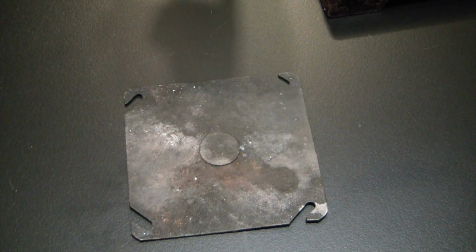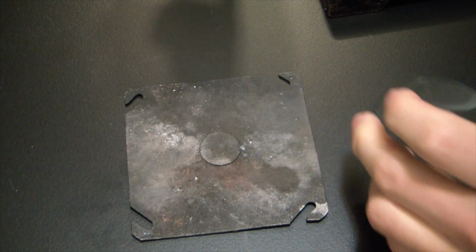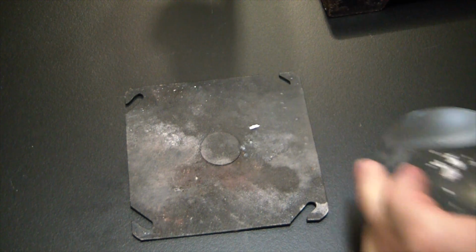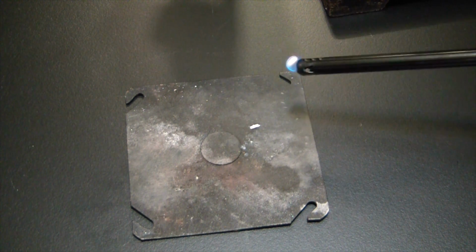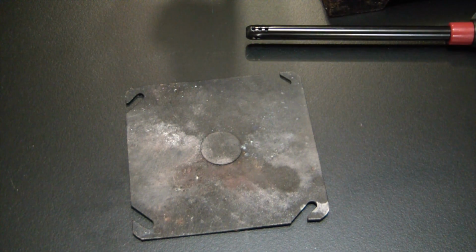So let's take a little bit of this. Whoops, put my pucker goggles on. Take a small sample here, put it on the burn plate. I'm going to move the bulk of it away just so the shock doesn't set off the whole watch glass. And let's give this a test. Wow. My ears are ringing. Holy hell. That's some powerful stuff.